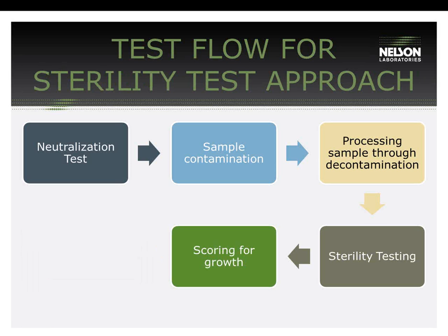As for sterility testing, it is almost the same as the bioburden analysis. The only difference between them is the samples do not go through the extraction phase. The samples are sterility tested right after the chemical or the antibiotic process in a sterile container and then incubated for 7 days at a specific temperature for the organism that was tested and scored for growth at the end of the incubation. This process gives you a pass or fail, or a growth versus no growth result.